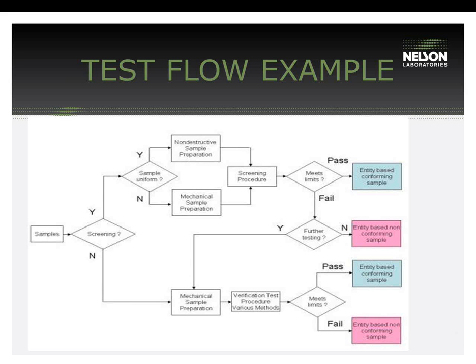For example, if there are several steps with antibiotic or disinfectant rinses, it is better to know first how much microbial reduction you obtain in each step. This not only helps you to optimize or eliminate the process steps that are not necessary, but decreases your processing time and makes the processing more efficient, in which Martel has gone into detail on optimizing or eliminating the process steps.